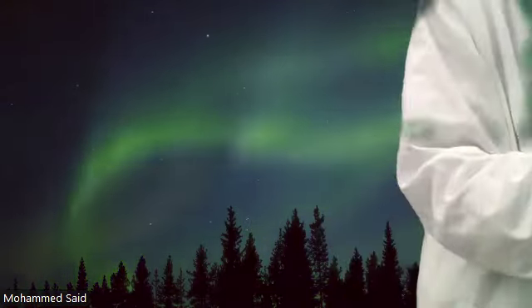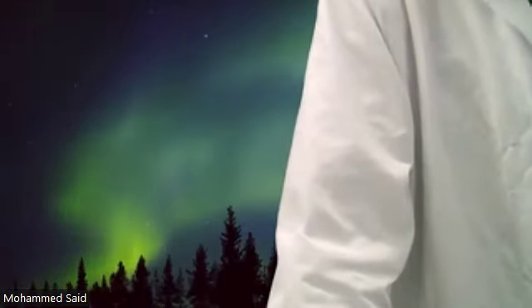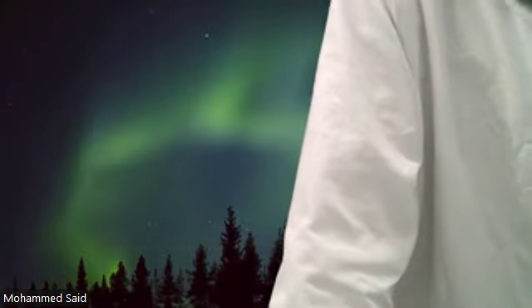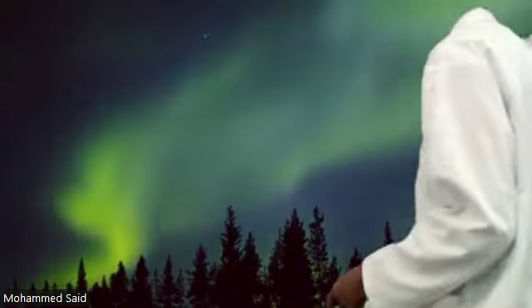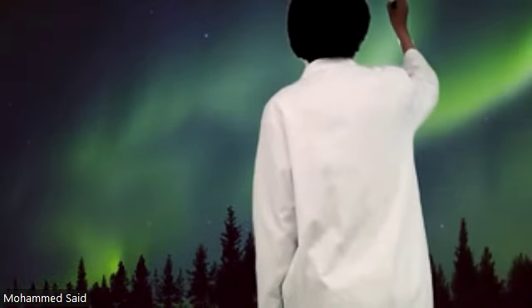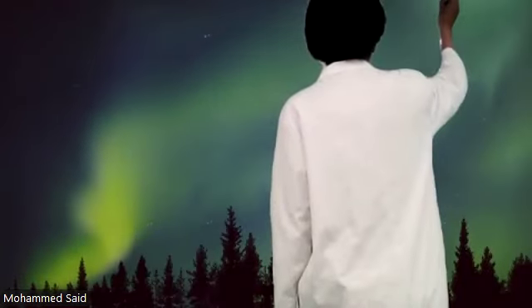Now, when it comes to values that you should see, I said that the range is variable, right? Because after all, you're doing this manually. And I said that you should see a range from 15 to 75. That's a large range, but I'm trying to be generous essentially.